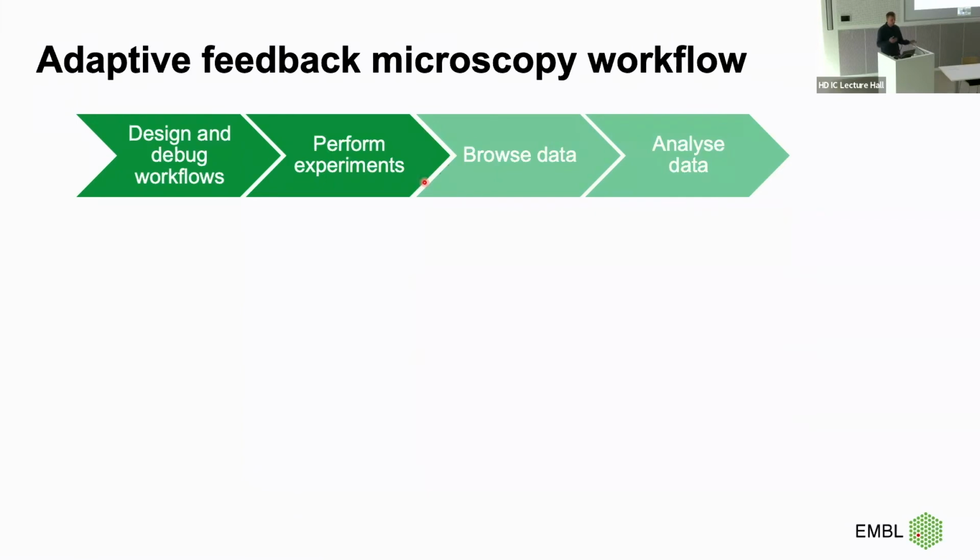So first of all, in general, what are the requirements for such a workflow? We need not only the procedure for when everything runs, we also need the procedure for how to adapt it while it's running, right? And how to deal with this afterwards. So first of all, we need robust protocols or training on how to design and debug this workflow. Sometimes we do it with our users. Sometimes we allow users to do it themselves, if we already have a similar application which they can evolve.